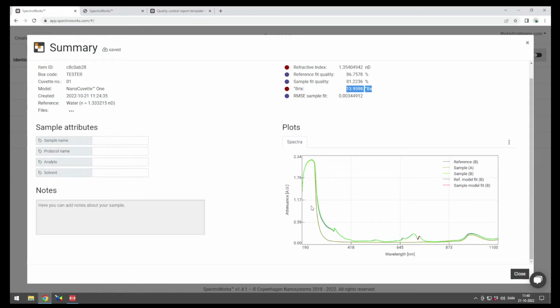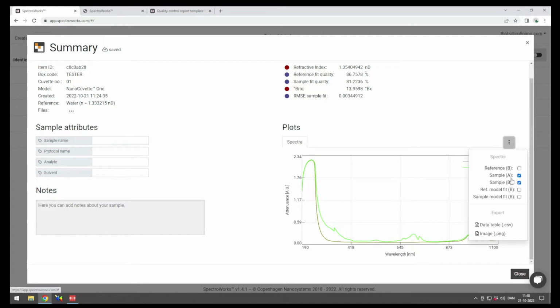You have all of the different spectrums laid down here, and you can choose which one you would like to see. So we can, for instance here, see that there is a shift between the sample and the crystal, but we could also look at how the sugar in the DI water changes.